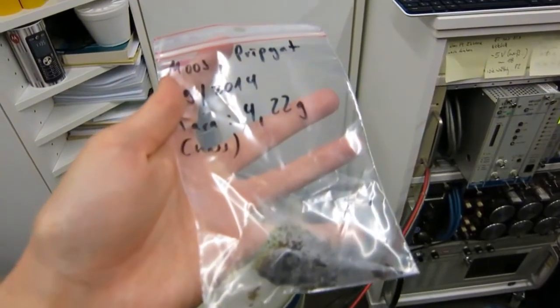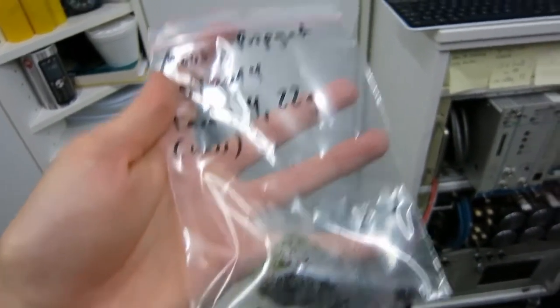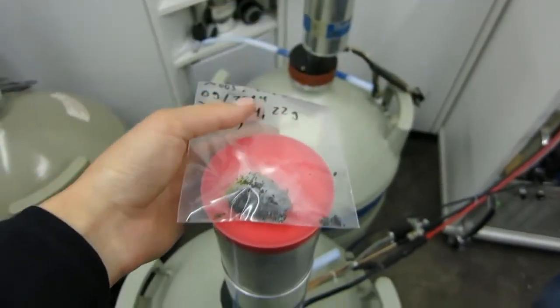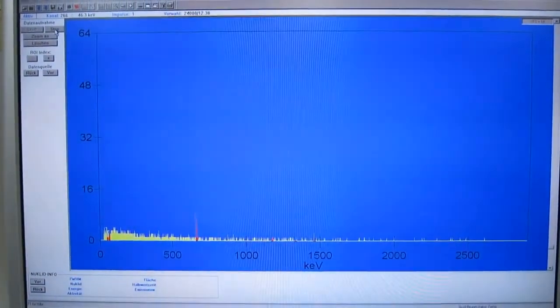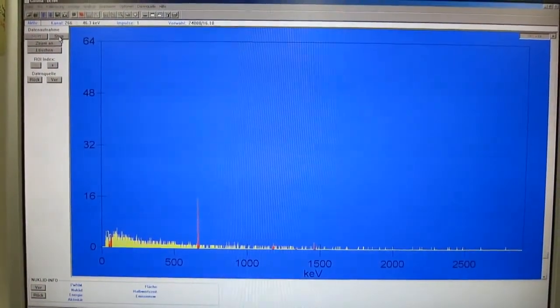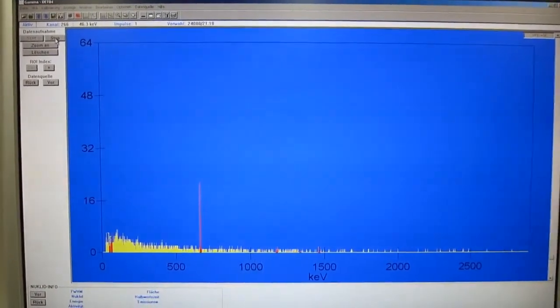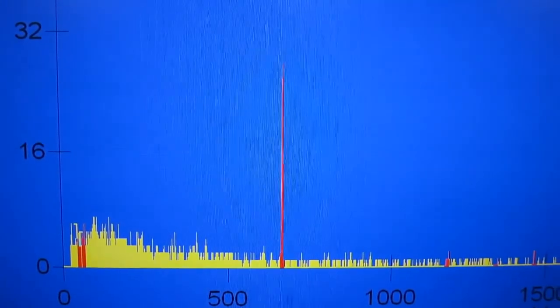But let's also look at a sample of moss from Pripyat, from just where that apple tree is located as well. I'm just dumping it on a random detector without any lead shielding, because that will be sufficient. Can you see that big red peak rising just right off the 500 keV on the scale? You can see it's rising so fast it's easy to tell apart from any amount of background radiation, because this is a huge amount of cesium-137.